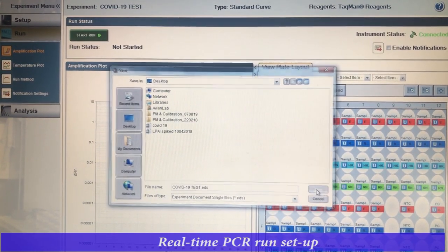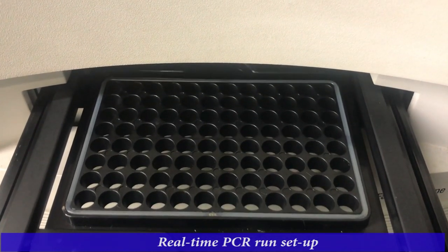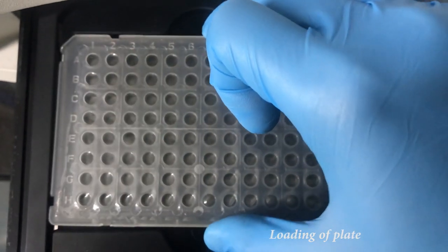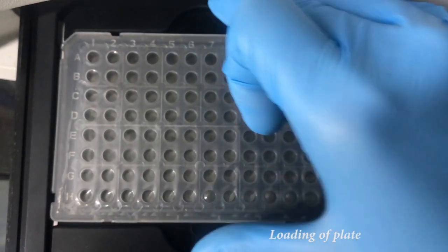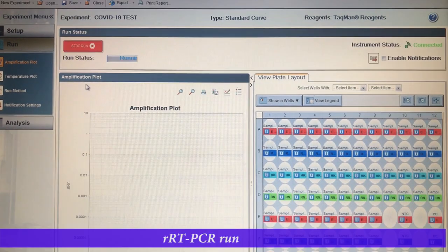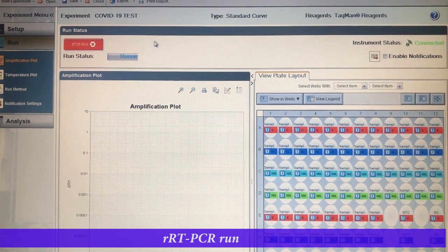Place the reaction plate from the PCR cooler onto the plate holder in the machine. Go to the run method. Enter the cycling condition and the run method. Click on Start Run. Note the estimated run time which appears on the screen.